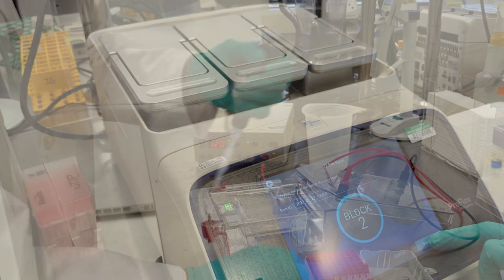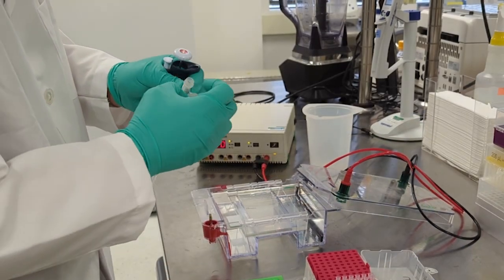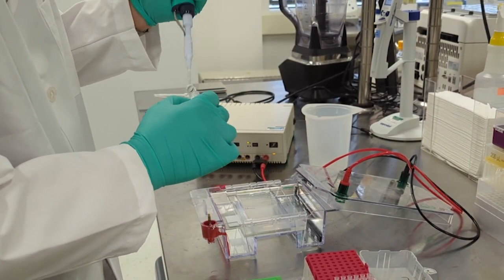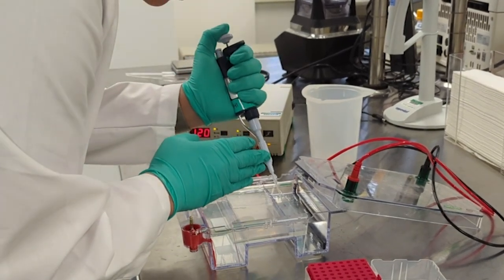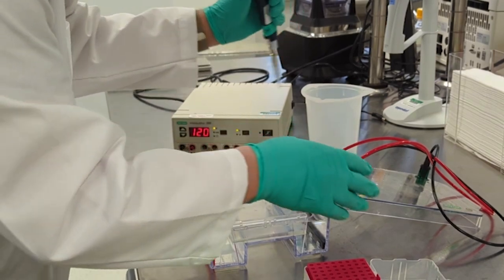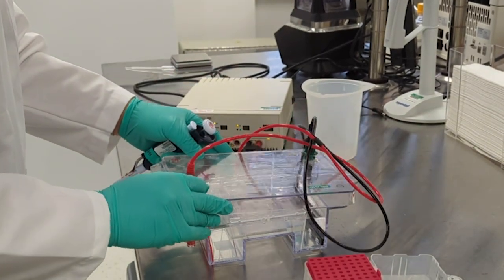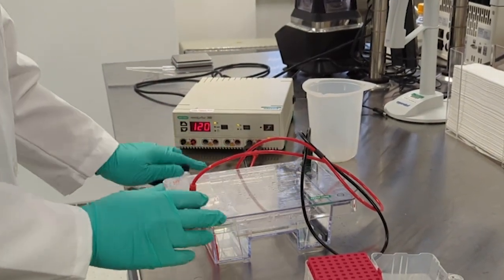Run the PCR product on an agarose gel to determine the integrity of the PCR product. The presence of only one clear band is preferred.